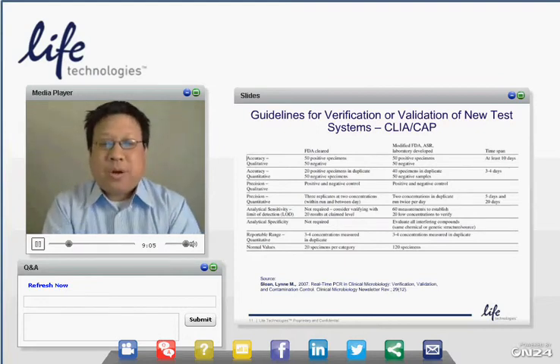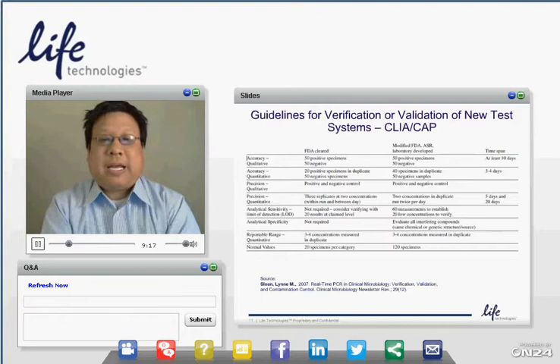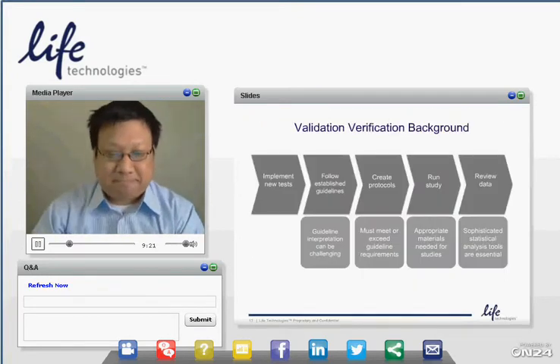And so what we did with these papers is that we programmed these recommendations into the software. The software stores these peer-reviewed papers and can then be called upon to look at these guidelines: how many levels, how many replicates, how many days.